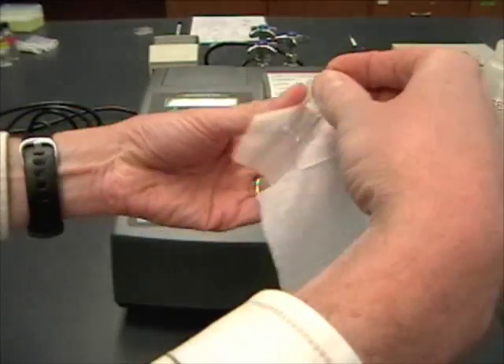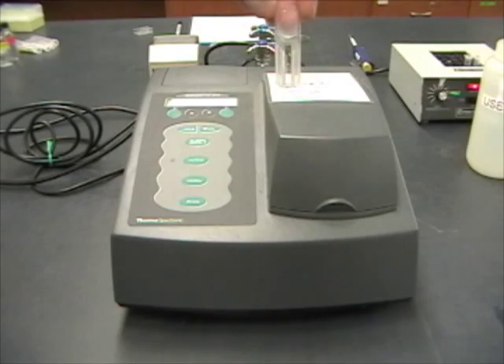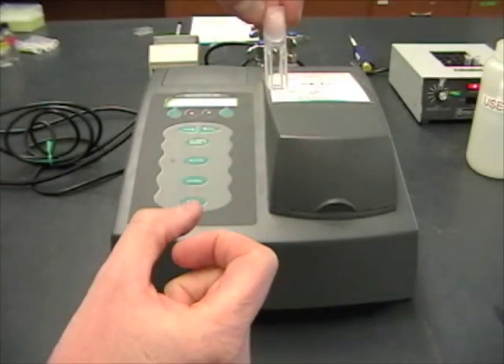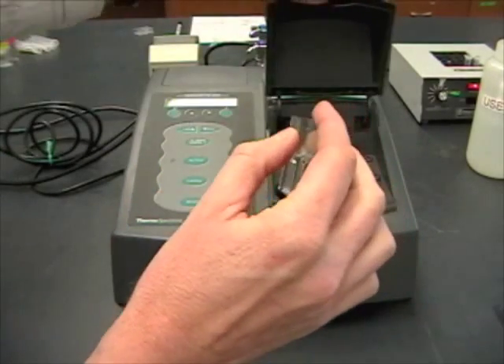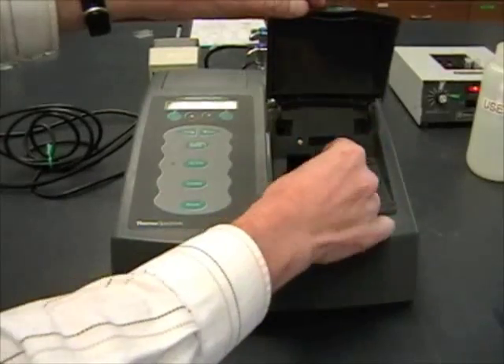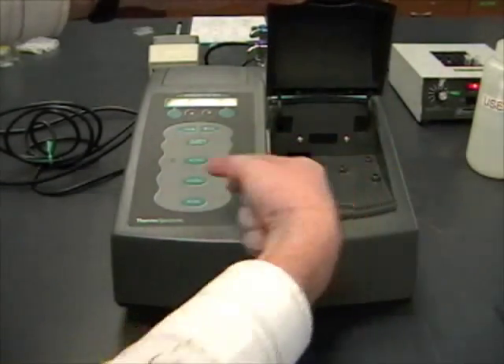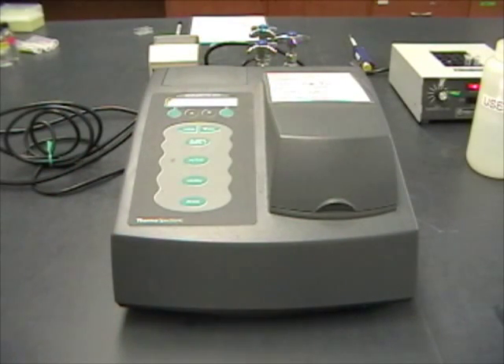I'm going to wipe it off to make sure there aren't any fingerprints on it. You'll notice that the cuvette can go in here two ways — you want to look for the side where there's the clear window going right down the middle. The spectrophotometer gets blanked with water, and then you put this in so that the light will pass through that clear window. Then you read the OD600.